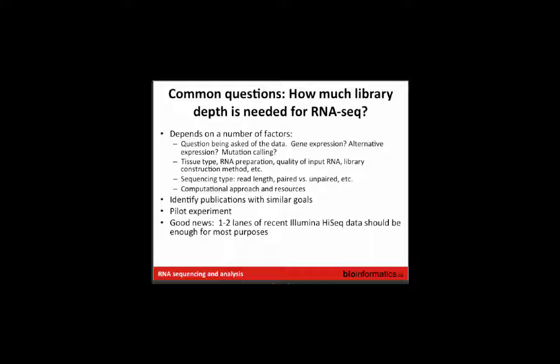But a lot of our sequencing is tumor sequencing, so we're often in the position where we've identified somatic mutations in the DNA, and we want to be able to assess the expression status of every somatic mutation in the RNA. Some of those transcripts aren't highly expressed genes, but they could be really important genes. So we want pretty good coverage across the transcriptome to give us a chance of detecting every mutation in every gene. And we don't want to miss that for lack of coverage.